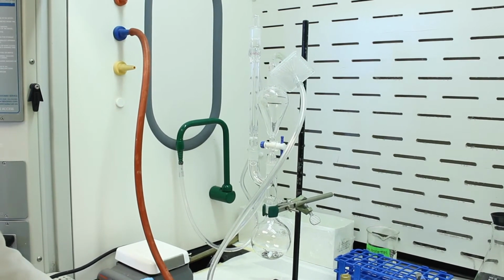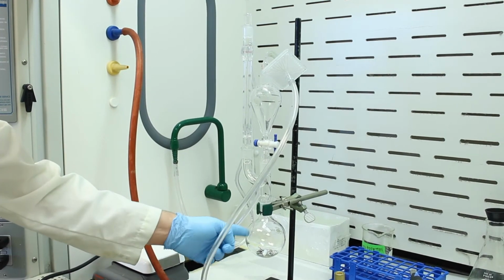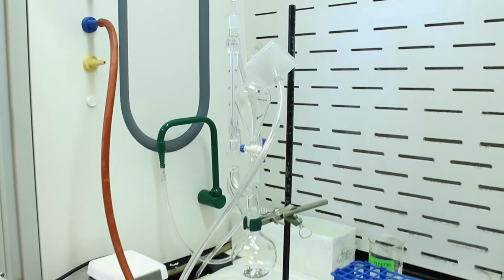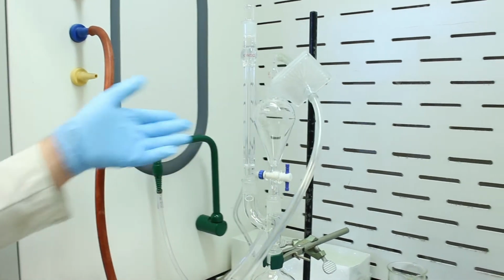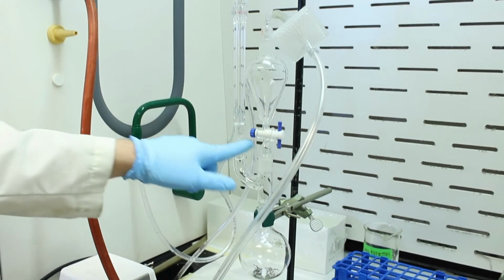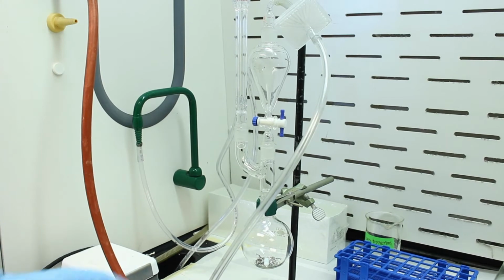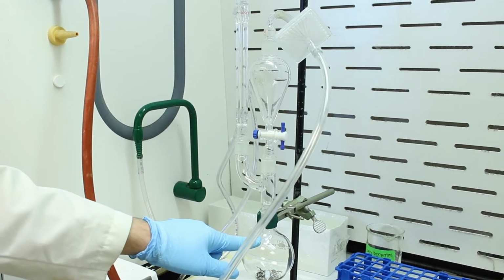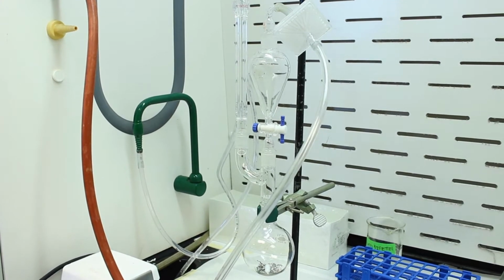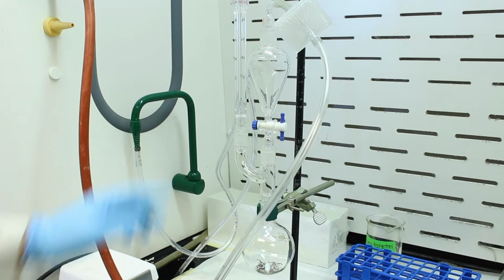Grignard reagents are extraordinarily sensitive to water, so much so that the glassware itself can destroy your reagent. You might not think of it, you look at a flask, it's dry, but glassware, because of its silanol groups, is very polar. So even on dry glassware, there's a very thin, perhaps atomically thin layer of water adhered to the inner surfaces, and in fact the outside surfaces of the glass, and that water will react with your Grignard reagent. So before we can even make the Grignard reagent, we have to heat the apparatus.